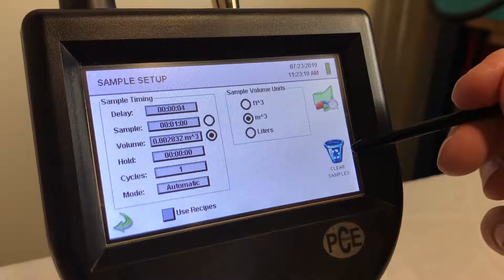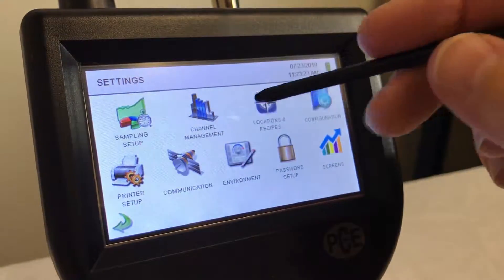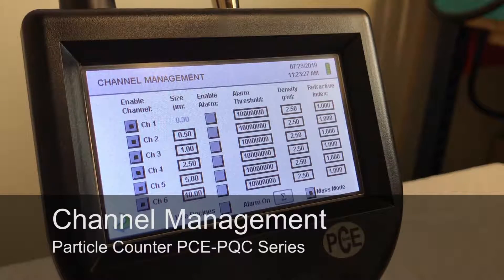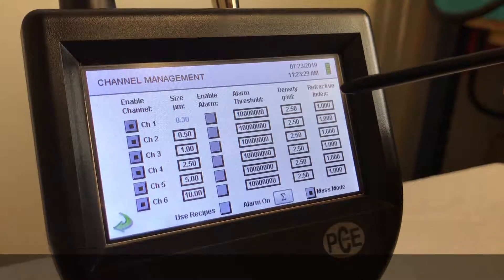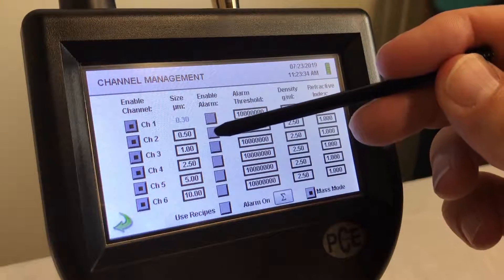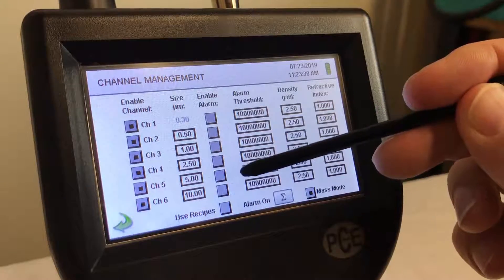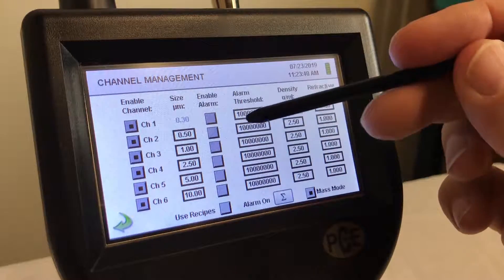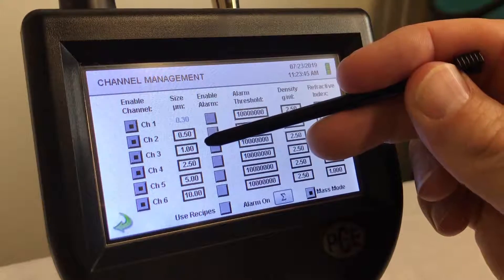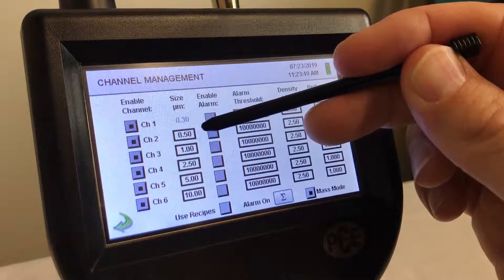This is also where you could do your deletions right here. Channel management — the channels are variable, and you can change the size of each channel depending on what you may be looking for. The only caveat is you can't go smaller than the previous channel. So for example, on channel three, I couldn't go less than 0.5 microns.